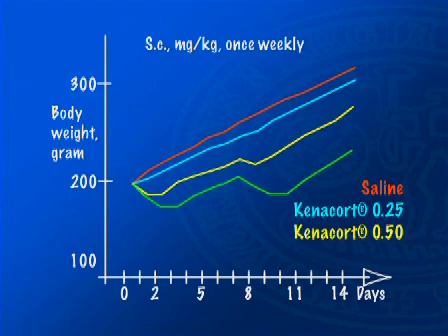This enables toxic doses of angiogenesis modulating test substances to be avoided, an important benefit as it may be almost impossible to interpret the results in terms of specific anti-angiogenic effects if a toxic effect has been involved. As adult rats grow considerably faster than adult mice, the effect of toxic agents on body weight gain should be a more sensitive indicator of general toxic effects in rats than in mice.